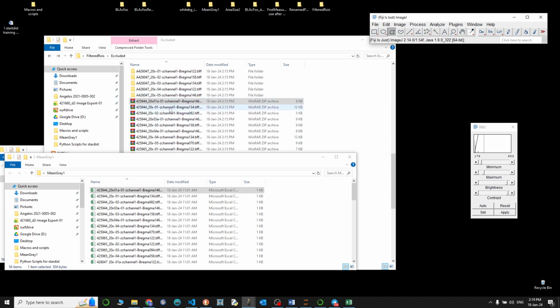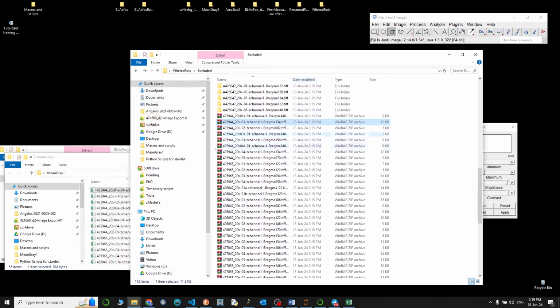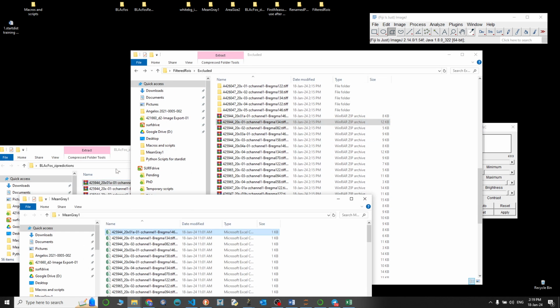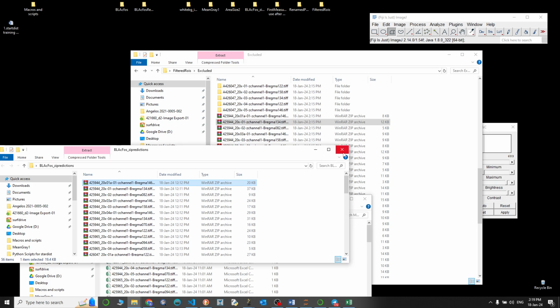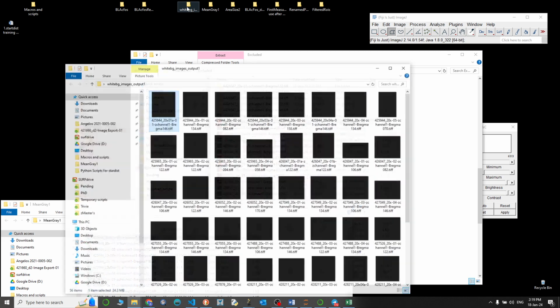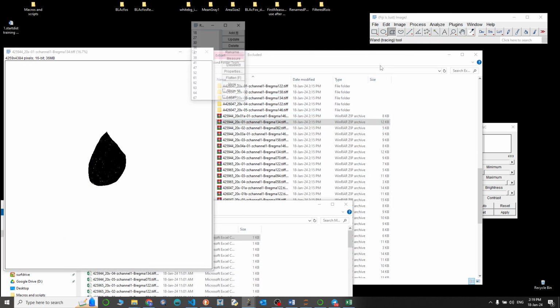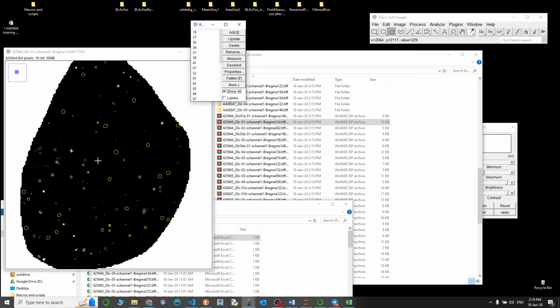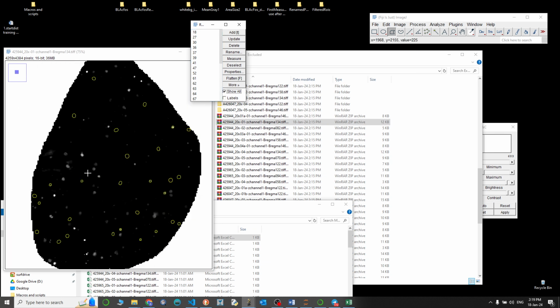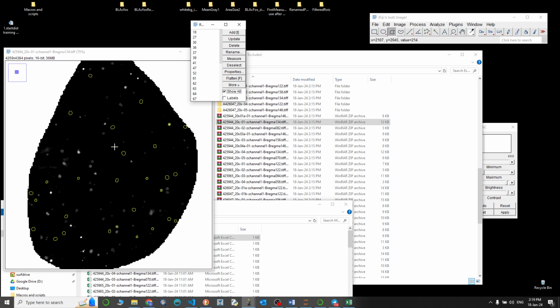That's actually because now I'm curious. Let's look at one more and see if it worked slightly better at least. We have the zip predictions. Okay, let's open a file. Let's go for file 2 and let's bring that here. So all predictions. So that actually looks better. Huh? I should have used this one, but I'm too honest, so I will not change my video. But yeah, you can see how it works.